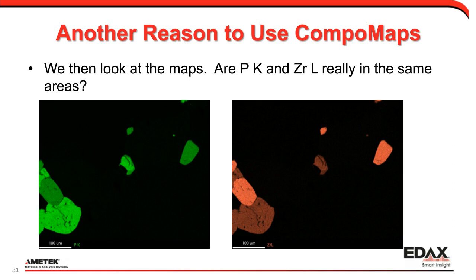I'll also make note, you can do some image enhancement. So if you really wanted to scale those out, you could probably just strip out the lower intensity gray areas, but that's not really the way to solve a scientific problem. We don't want to do image enhancement to solve our problems. We actually want to investigate the chemistry and understand it further.